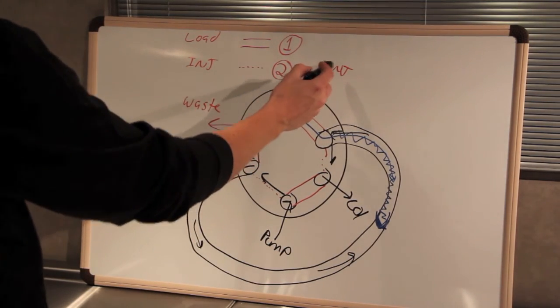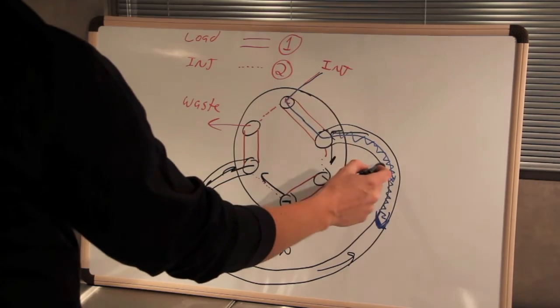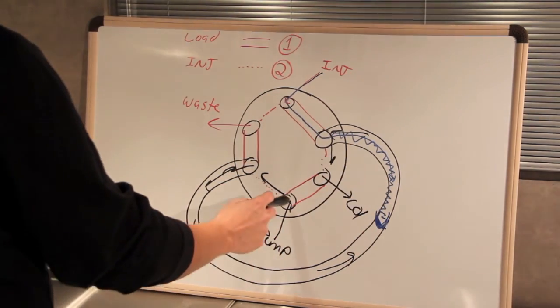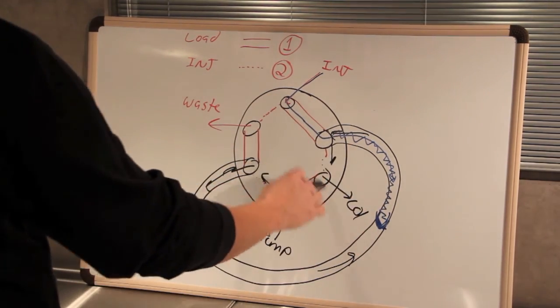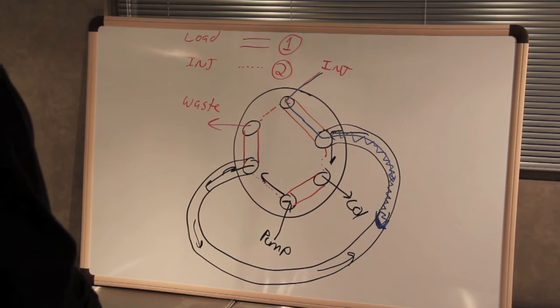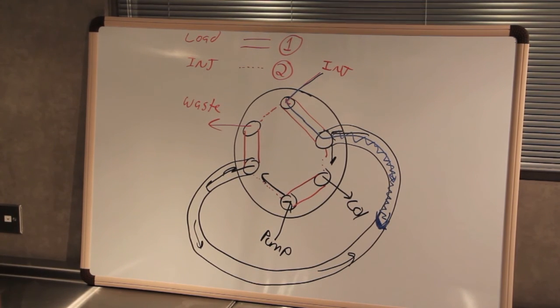So you can see that when you load it you load in this direction and when you inject it it'll back flush the loop onto the column. Thank you for your time and I hope you found this helpful.